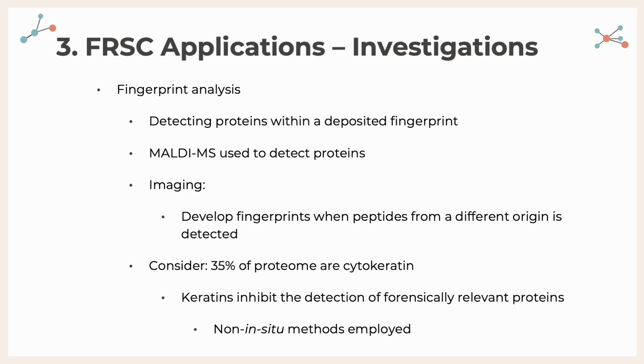There's a special case for certain fingerprints. Those are fingerprints that are deposited in blood. You're detecting heme and hemoglobin subunits, which can differentiate blood from different sources, so non-human versus human sources of blood.